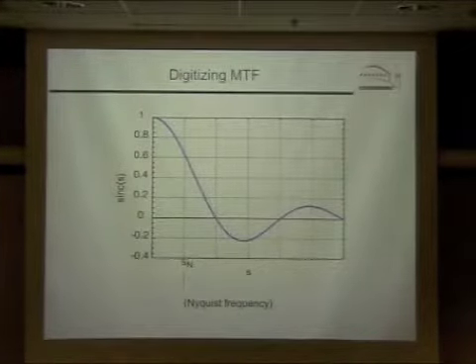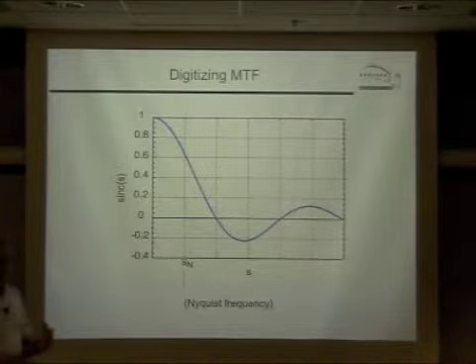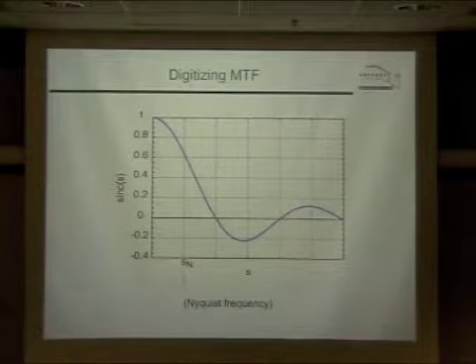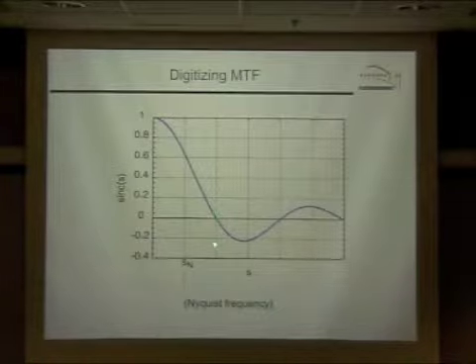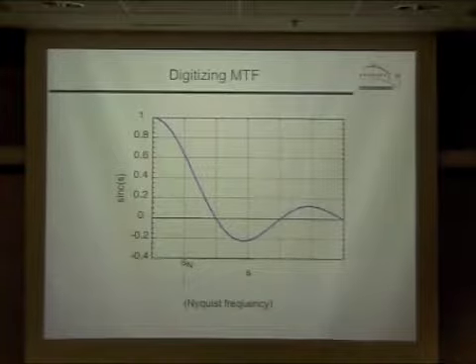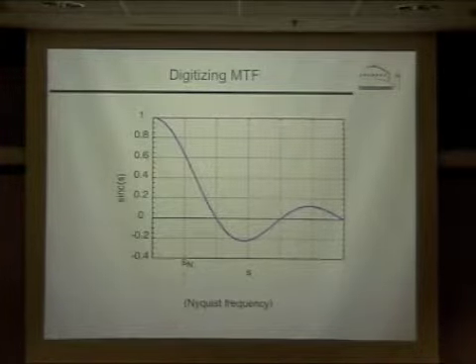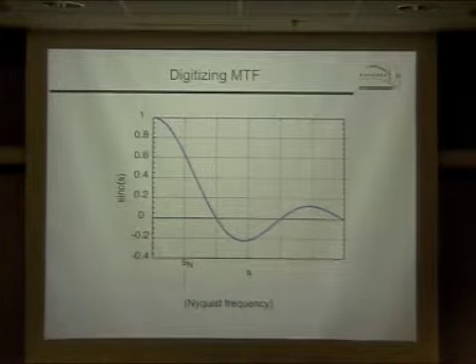There's a famous theorem by Shannon and Whittaker that says, let me not go into that right now. That's just kind of a nuisance. But this curve here is still kind of interesting. At this point, twice the Nyquist frequency corresponds to the spatial frequency where there is a full cycle, so a plus and a minus lobe of contrast variation in a signal within a single pixel.